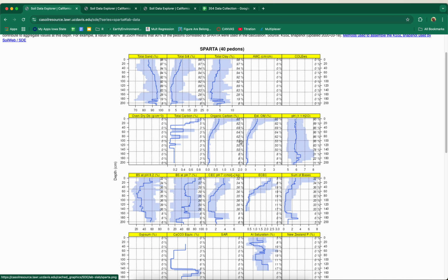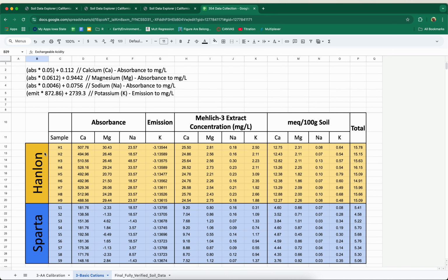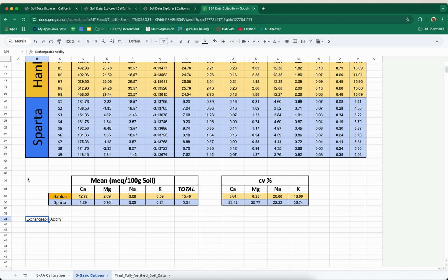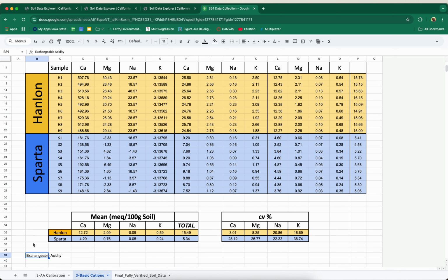I don't know exactly, but there are a couple of different potential reasons here. Our sample could have been managed pretty heavily. Maybe they dumped a whole bunch of lime on it right before we got our hands on it, in the era of 3 to 15 years ago, whenever it was harvested. We don't know exactly where in the landscape it was taken from, so it's hard to say. But generally, they're reducing the acidity present, especially in that sort of soil. So I can't really give you an exact reason, but that's my hypothesis at this point.